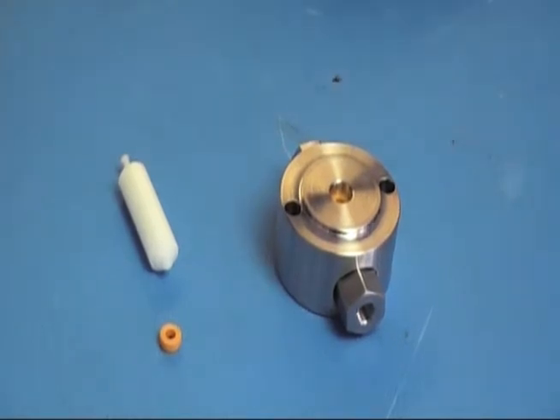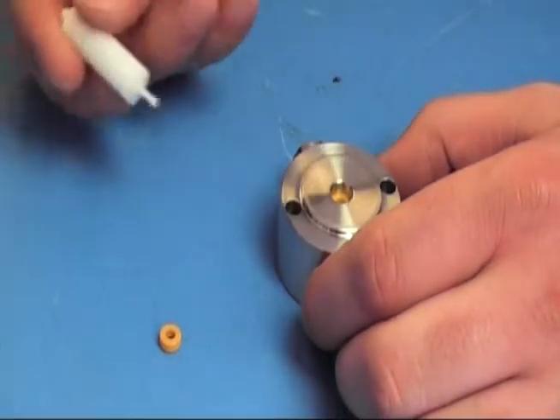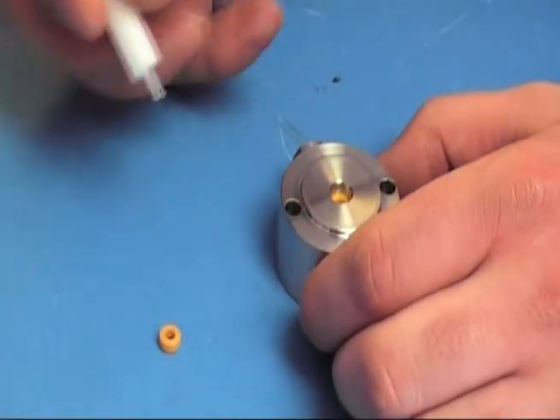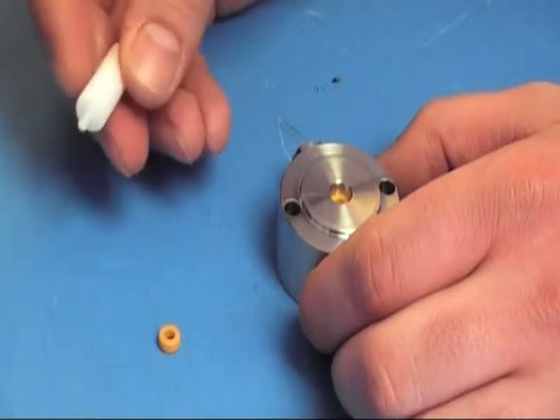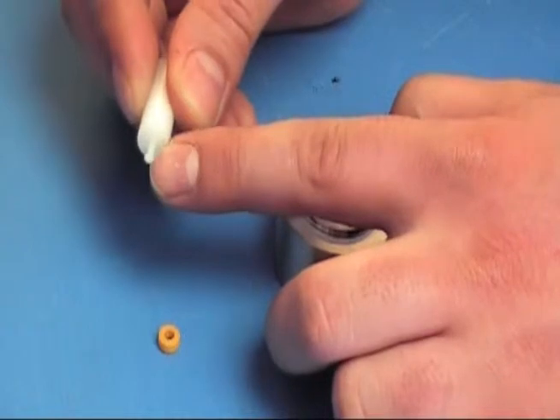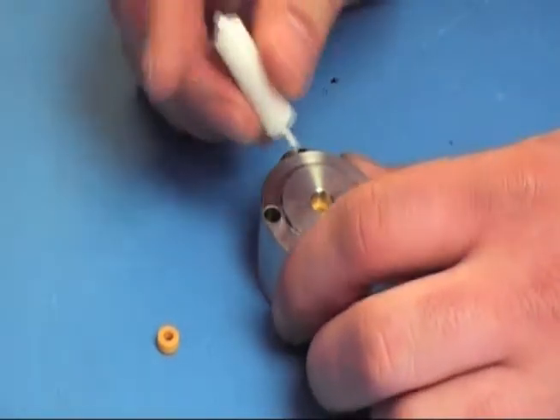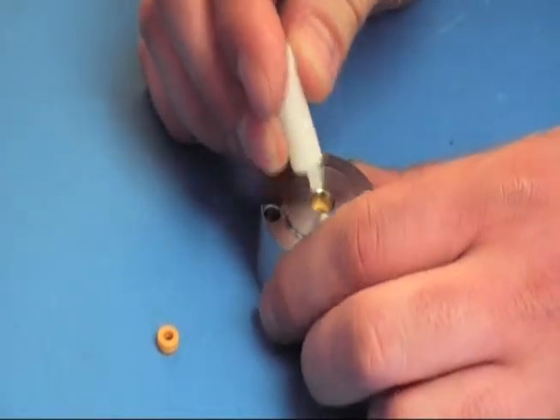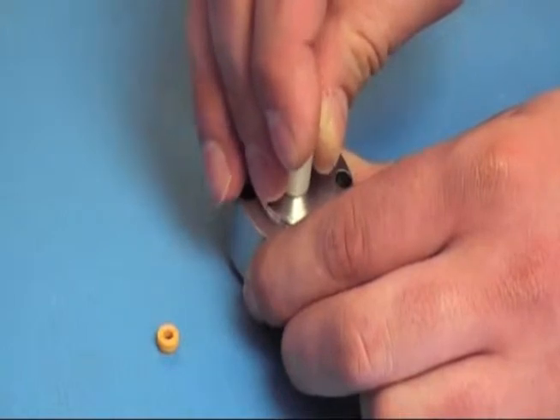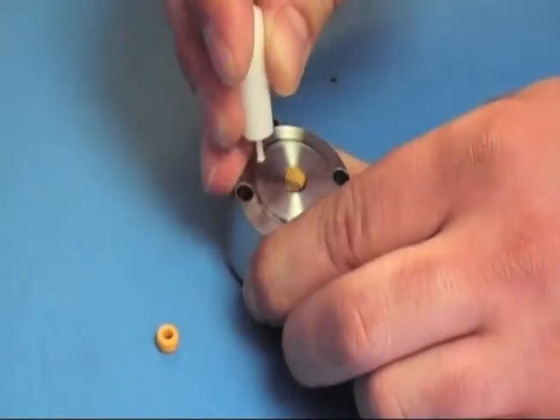To remove the seal from the head, you're going to use the provided seal tool. You're going to use the end with the lip on it. Go ahead and put it in through where the piston would go through. You can grab the edge of the seal with the edge of the tool and just pull it out.